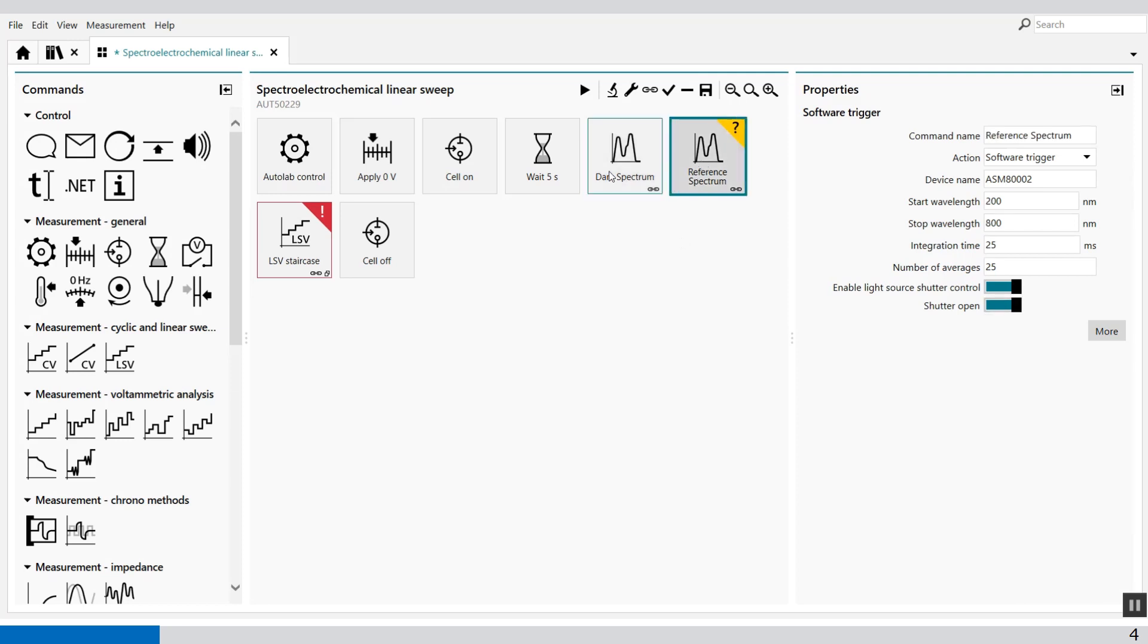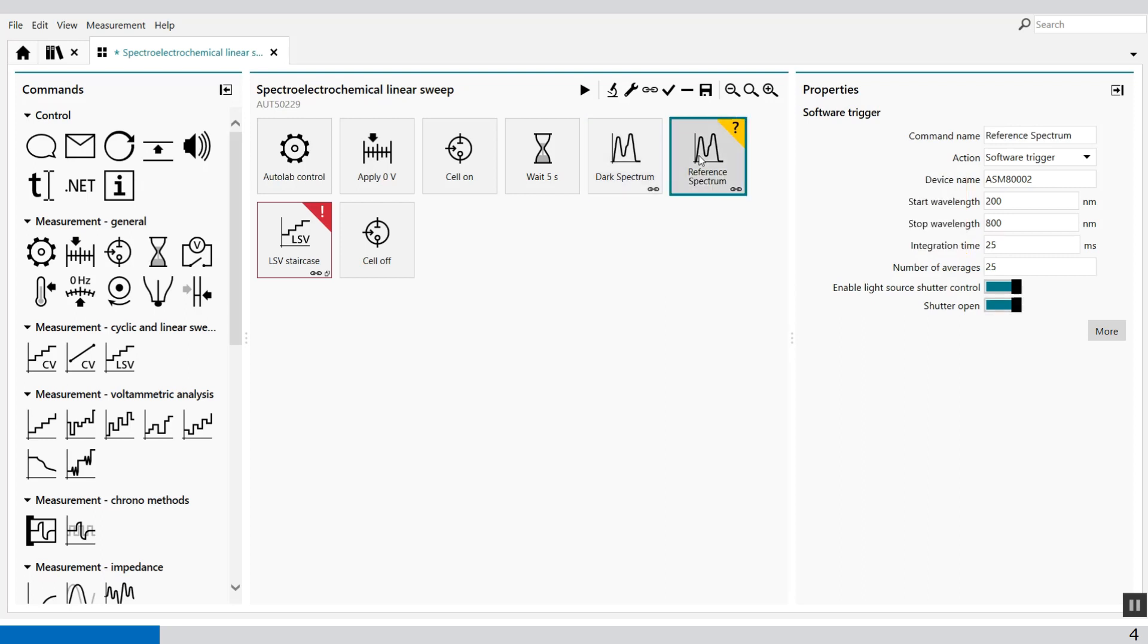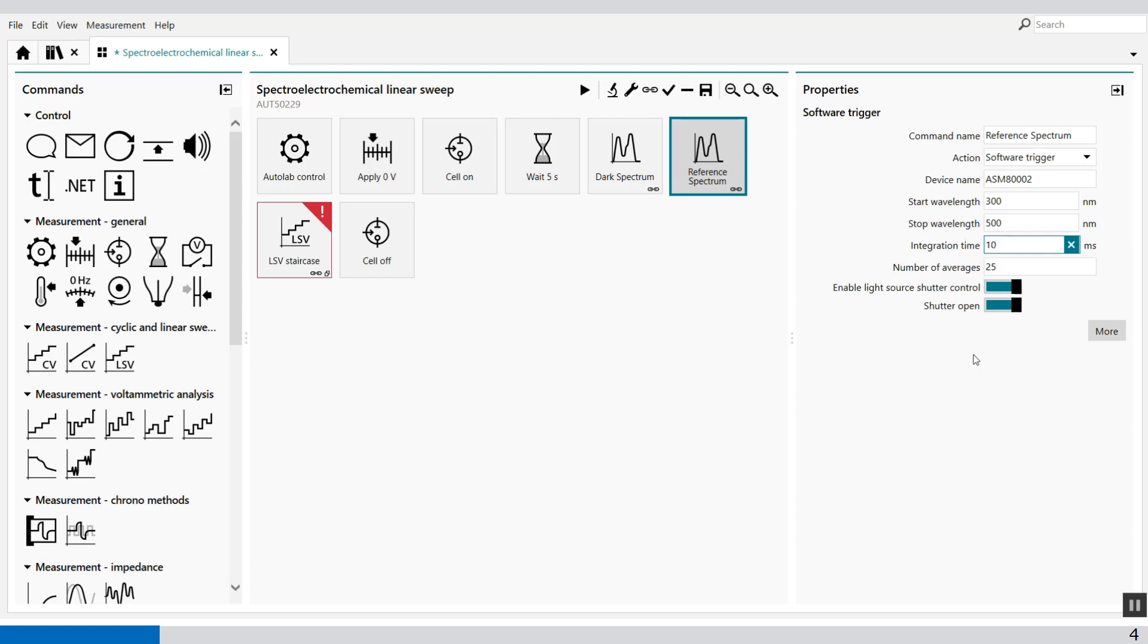My reference spectrum I have to set the same specifications and parameters which I did in the dark spectrum. So I also use the same in the reference spectrum so 300 to 500. And with the same integration time of 10 milliseconds. And now the shutter is open.